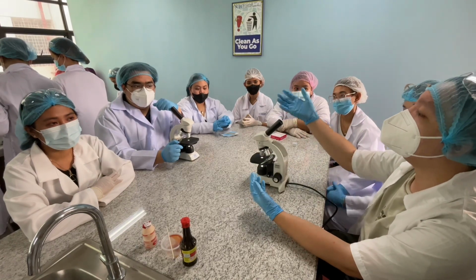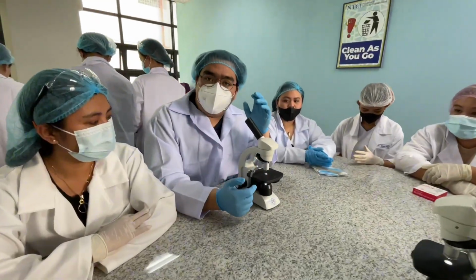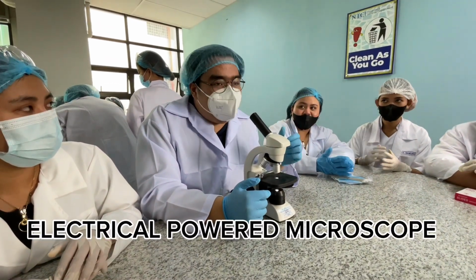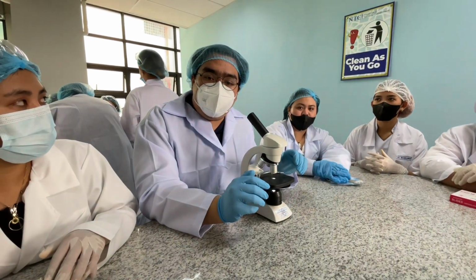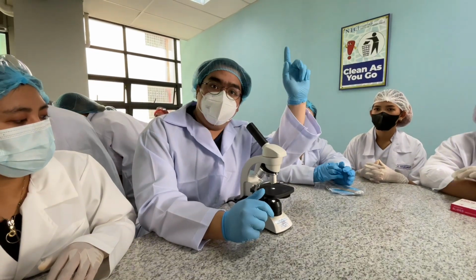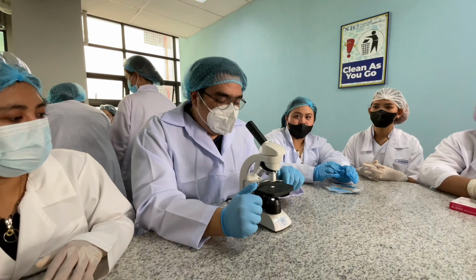So, Isaac, what do you have there in front of you? This in front of me is what you call your typical electrical powered microscope. Compared to a traditional light-powered microscope, which gets its source of light from the sun, we have our own light here.